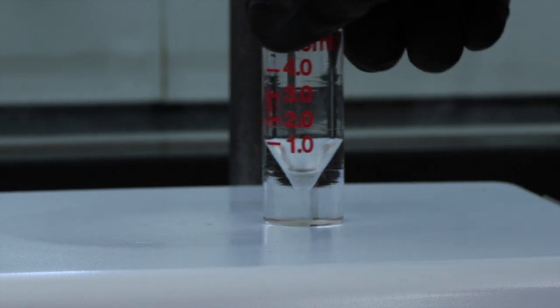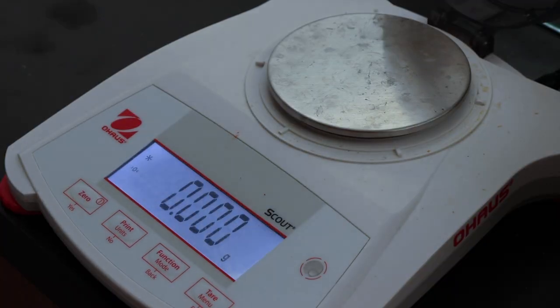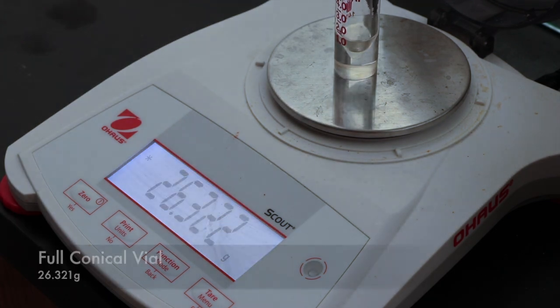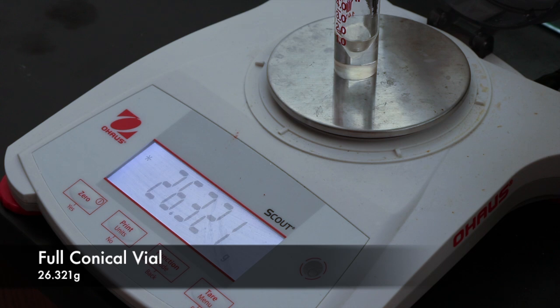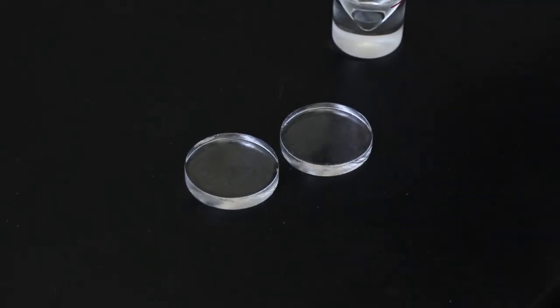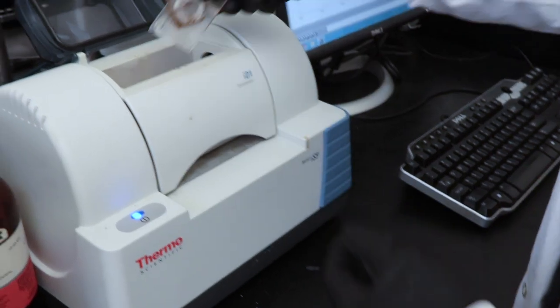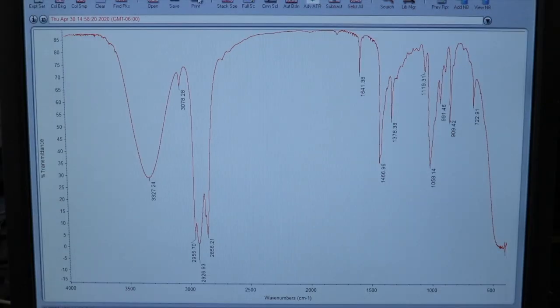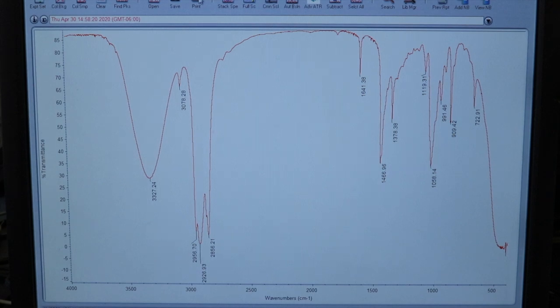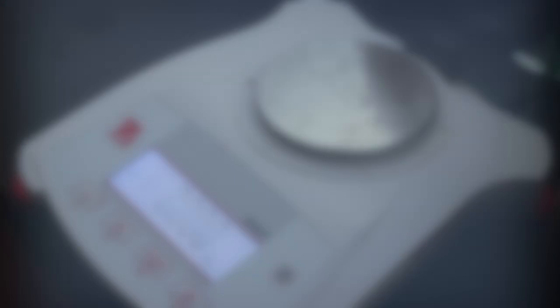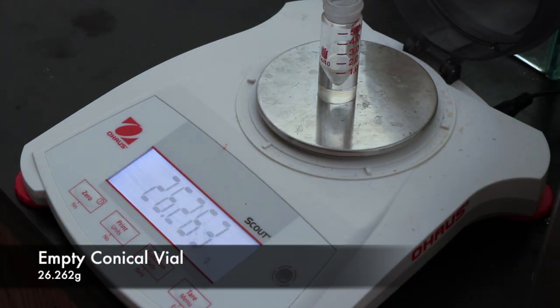And it looks like I barely got enough to take an IR which is totally fine. I'll weigh the full conical vial or the conical vial with the product in it which looks to be 26.321 grams. Now I can run a quick IR to see how well I isolated the product. So I definitely was able to produce the 1-octanol product but it looks like I still have some 1-octene contamination left over which you can see in two spots. The peak at 1641 would be for the carbon carbon double bond and the peak at 3078 would be for the hydrogens coming off of the alkene. I'll weigh out the empty conical vial and that'll be it for this experiment.